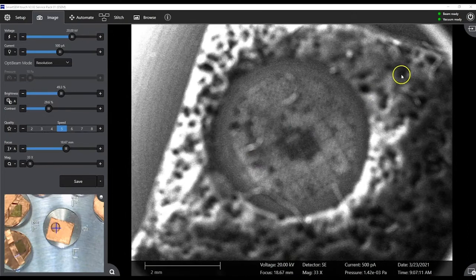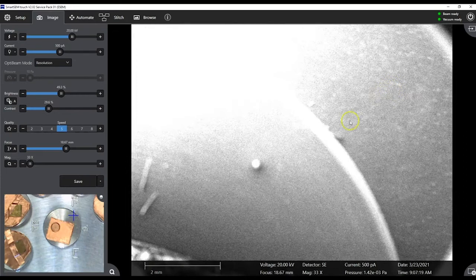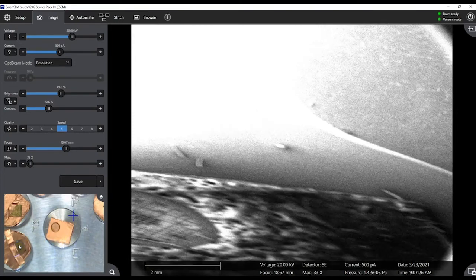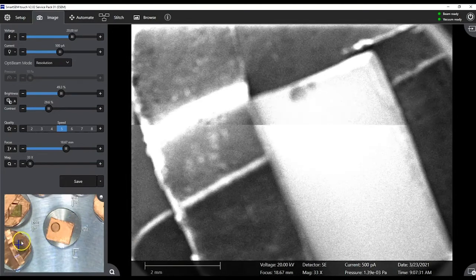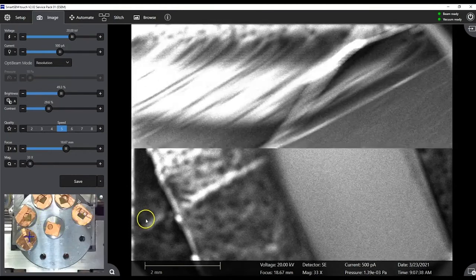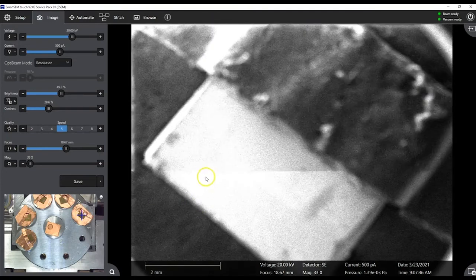The other way is to double-click on the screen, and it'll track. So here, now we're moving. Another way to do it is to go down here and double-click where you want to go. This way is really useful because it can get you from here all the way over here quickly and automatically, which has been super useful for us.